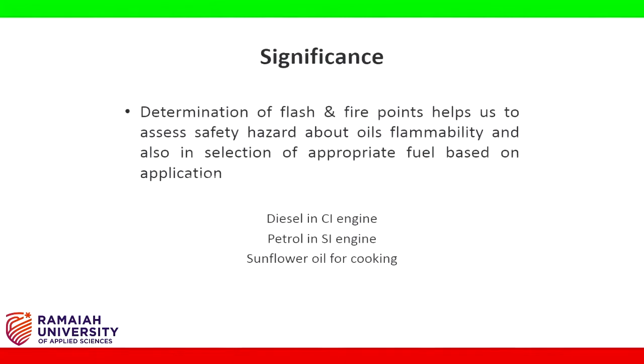What is the significance of flash and fire point test? Determination of flash and fire points helps us to assess safety hazard about oil's flammability and also in selection of appropriate fuel based on application, like diesel in CI engine, petrol in SI engine, sunflower oil for cooking.